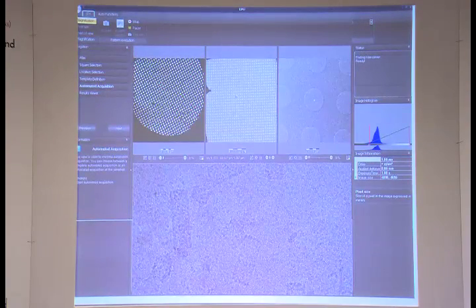And here's just the overview of what's happening. So we have our atlas, which is the whole grid. We have a kind of a square here, which is what this represents. We can see all the holes where the sample will lie. Here's a high magnification so that we can actually see the holes, and then we take an image in there, and that's all done automatically. We don't need to be involved any further. And something like this can run for 3 days, and it's fine. And we'll collect something like 4,000 images from this.